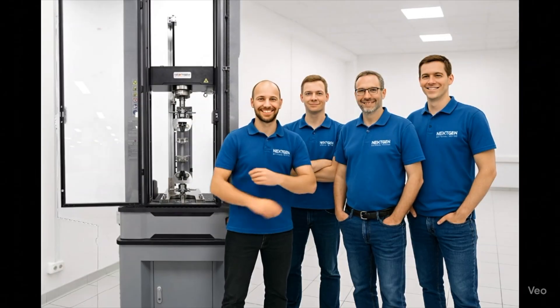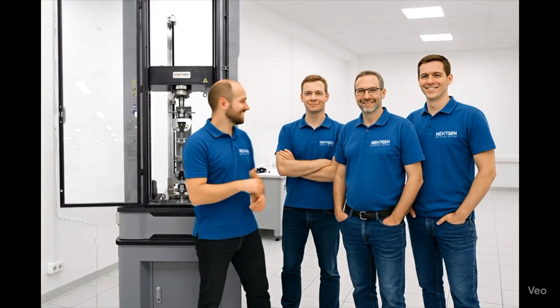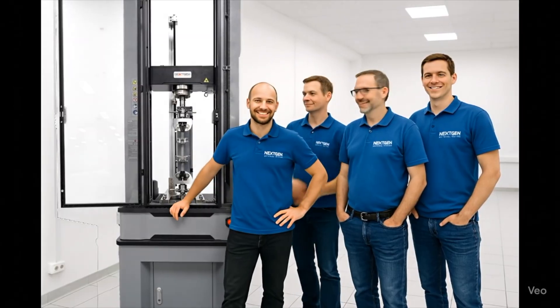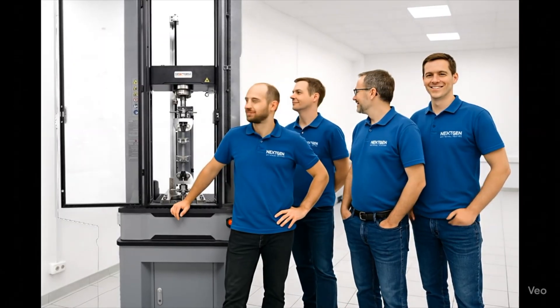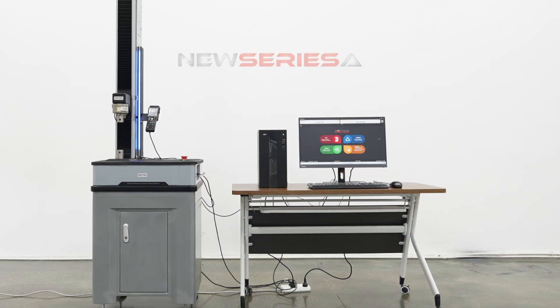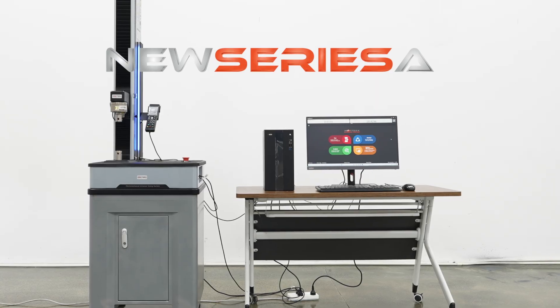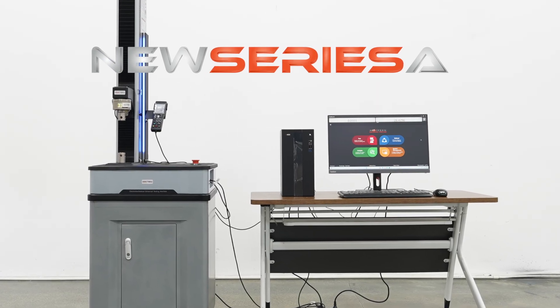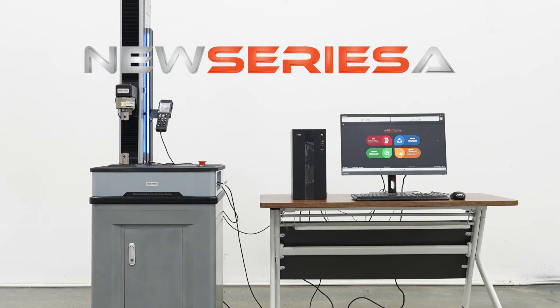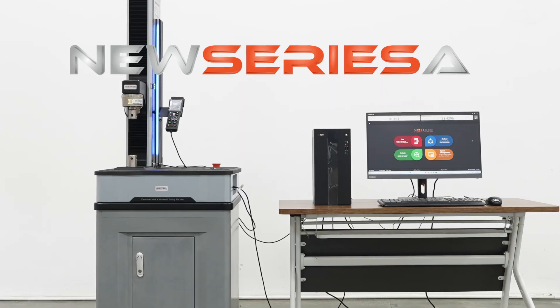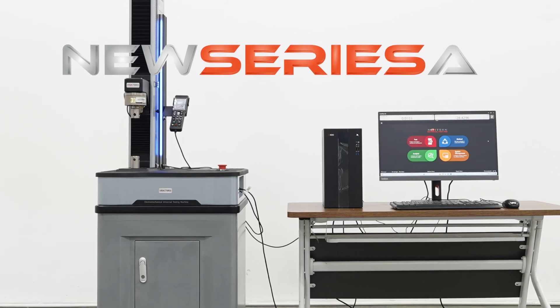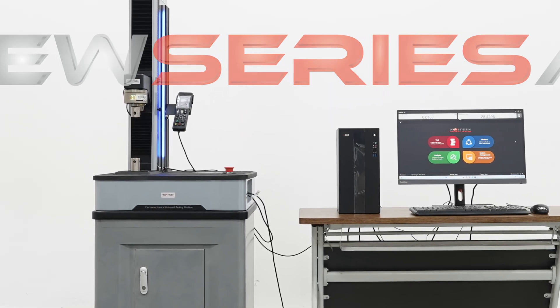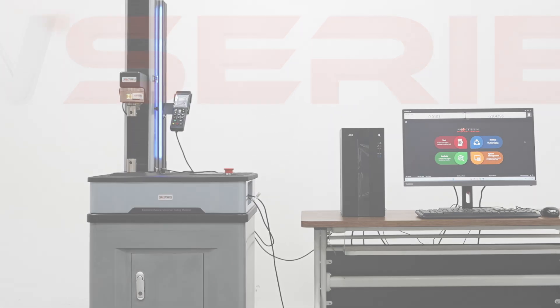Trusted after-sales technical support via NextGen's lifetime product support, including stock consumables, modular spare components, calibration, firmware updates, and easy maintenance. NGE ML Series A: compact design, precision, and support for advanced materials testing.